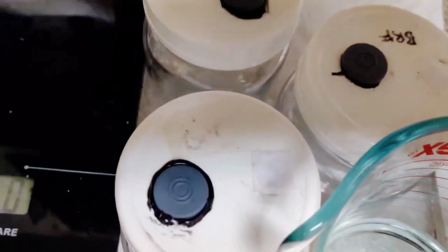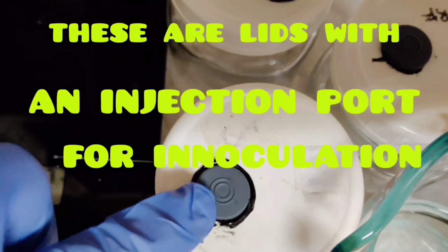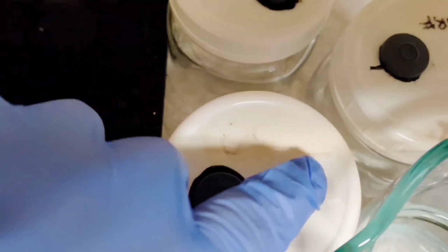I like to use half-pint jars with modified lids instead of petri dishes. I like that I can seal the jars, pressure cook them, and they're good to go when I need them. I usually remove an injection port to drop in sample material.